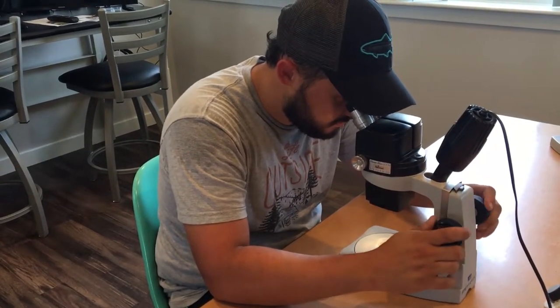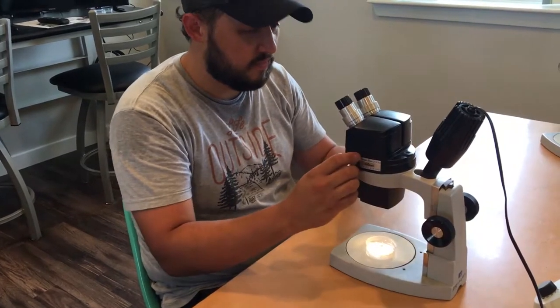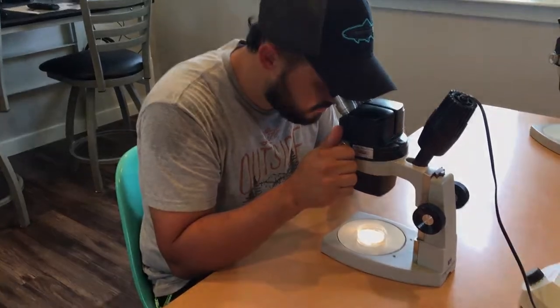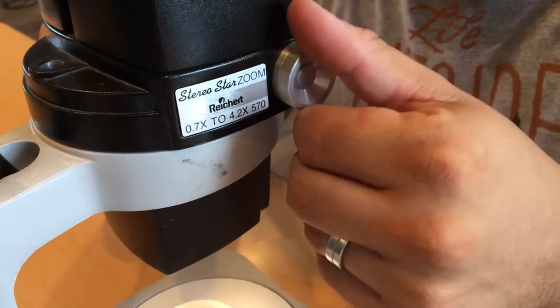Another adjustment knob is the magnification adjustment, which on these scopes is a smaller knob on the barrel of the microscope. This knob allows you to bring the magnification from the low of 7x up to 42x, which is this scope's highest magnification.